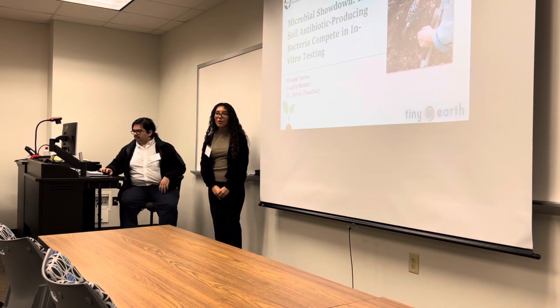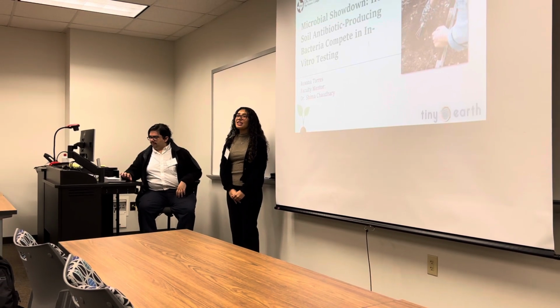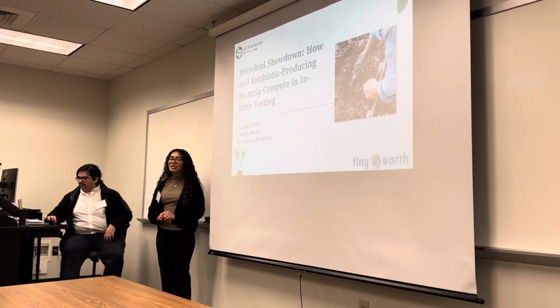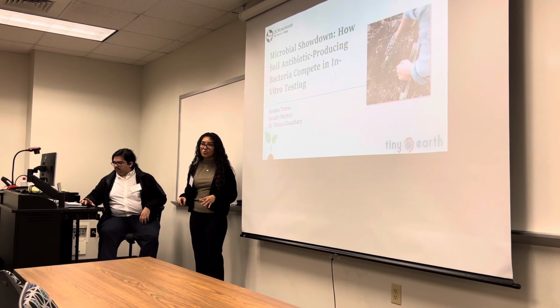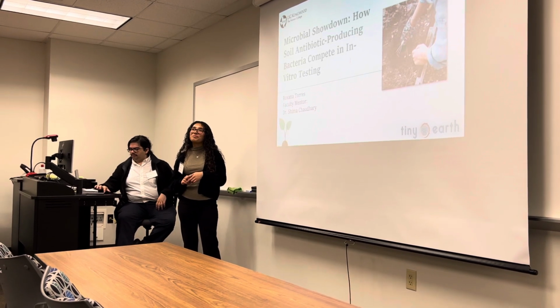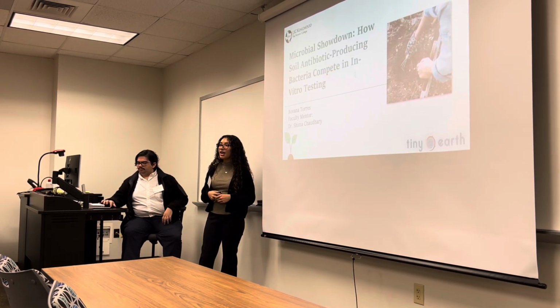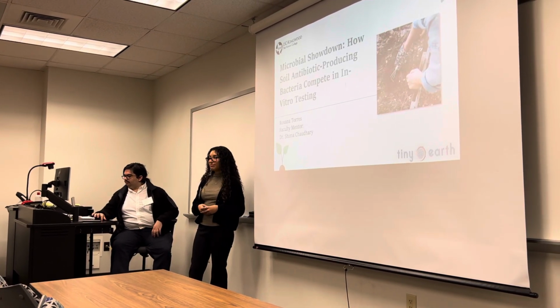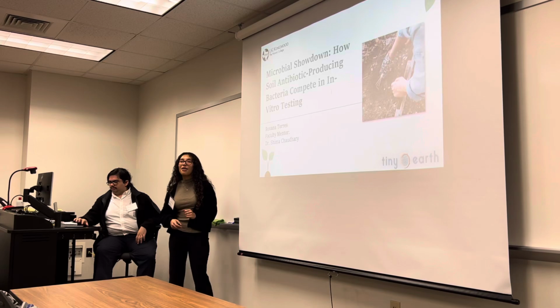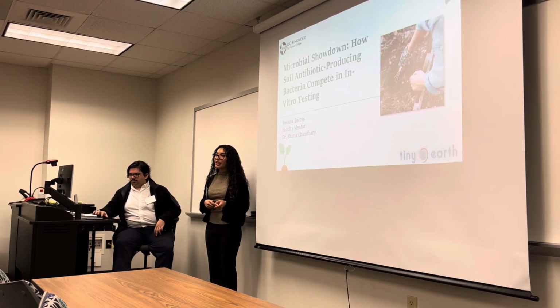And today I want to talk about my experience with Tiny Earth research in my biology classroom. Did you guys know that beneath this surface lie secrets to survival in the soil? These remarkable microbes produce antibiotics that exhibit antibiosis and compete against other types of bacteria. And so I want to talk about the microbial showdown of how two antibiotic producing bacteria can compete with each other in in vitro testing.